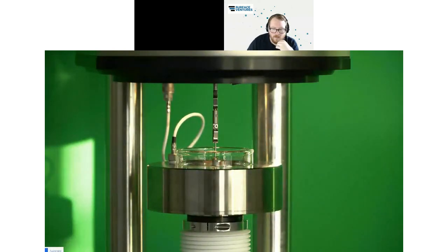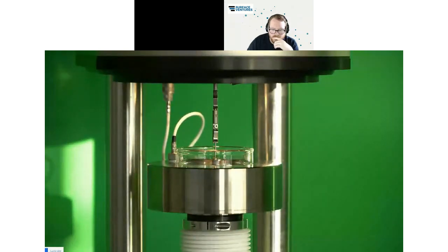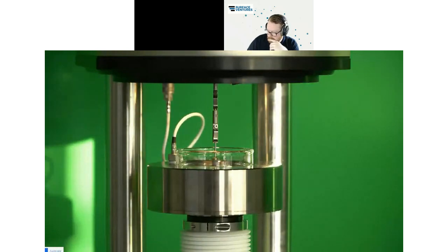And now you see the effect of the buoyancy. The implant is lowered down, so the weight should be dropping very fast, but because water is crawling up the implant, this is partially compensating for it. And now we are already pulling out the implant again.